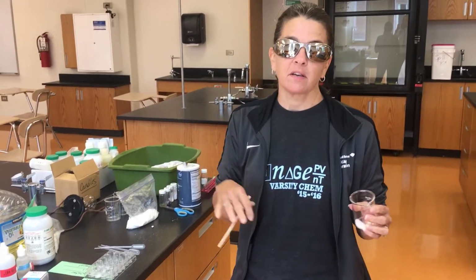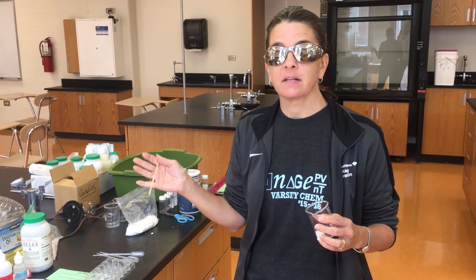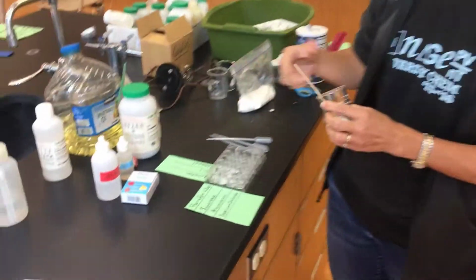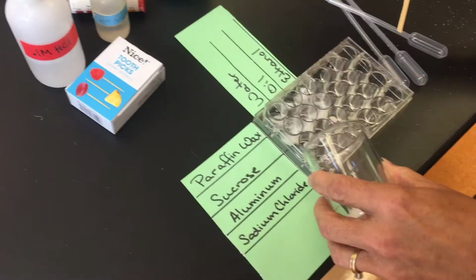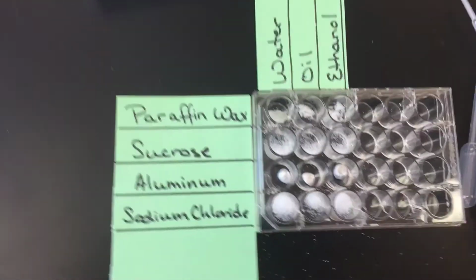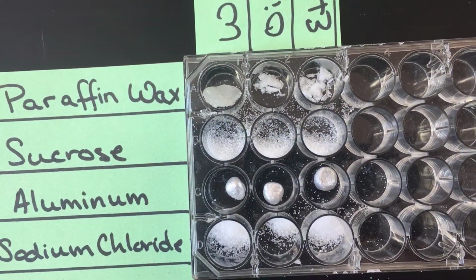Okay, so now we're going to run solubility tests on our 4 different substances. We're going to test their solubility in water, which is a polar solvent. We're going to test it in oil, which is a nonpolar solvent, and also in ethanol, which is a vastly less polar solvent. So here we go. I've already put most of my solids in. I'm going to go ahead and actually just do it this way. Put my sodium chloride into the last few. So you can see that each thing across this is all paraffin, and down I'm going to test water all the way down so you can see how my chart works.